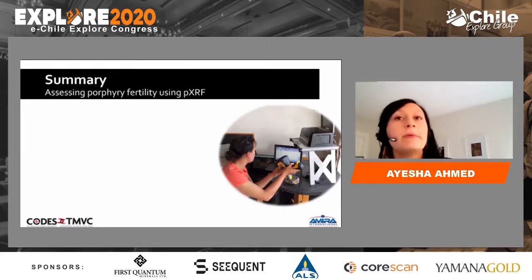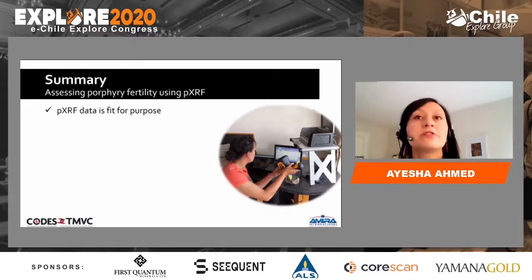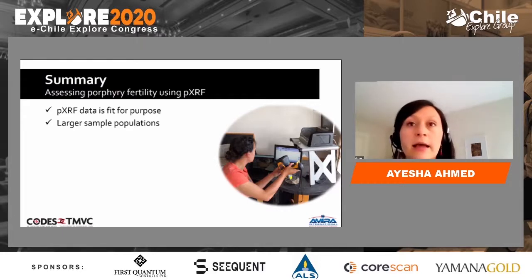All right, so to wrap up, hopefully I've demonstrated today that using a robust data collection workflow, PXRF spot analyses on intact rocks can be used to inform fertility diagrams. And there are a lot of benefits to using the PXRF for this purpose. Data from more samples can be collected with little additional cost, meaning that we have much better population statistics to base decisions on, and we can characterize entire intrusive suites.